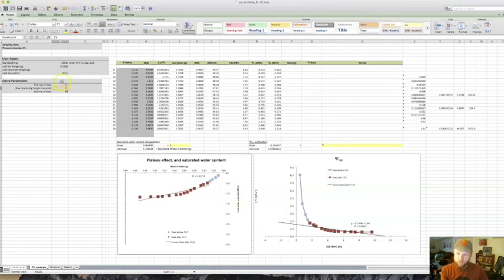So right now what I'm going to do is, obviously I'm not at the turgor loss point, because the red symbols in this figure, we want those to be all on the linear line. All right, and right now we can see a lot of those are part of the curved line. So these three are definitely on the curved portion. Let's move that down by 3.